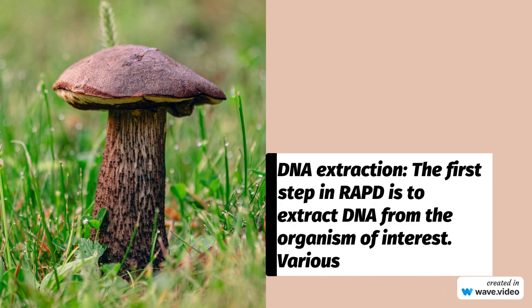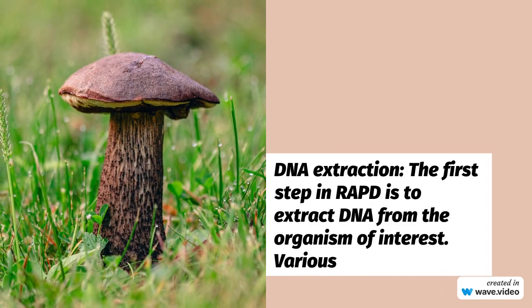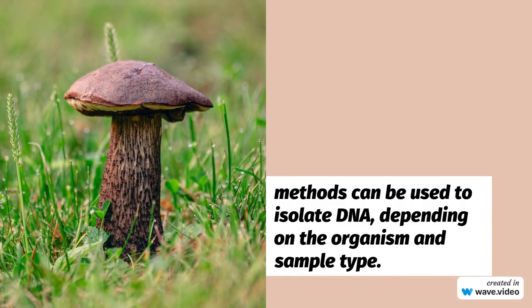DNA extraction. The first step in RAPD is to extract DNA from the organism of interest. Various methods can be used to isolate DNA, depending on the organism and sample type.